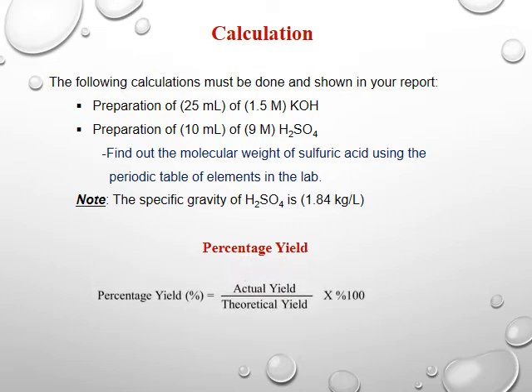The percent yield of any molecule equals the actual yield, اللي هي بالمختبر الناتج اللي انتم تستخرجوه, like let's say as a powder, نوزنه بعد يعني ما يكون dried، وبعدين نقسمه على theoretical yield اللي انتم تستخرجوه من المعادلة, times 100%. يطلع عندكم النسبة ممكن 30 40 50 whatever، بس المفروض تطلع بال 75% بالنسبة للبوتاش ألوم.